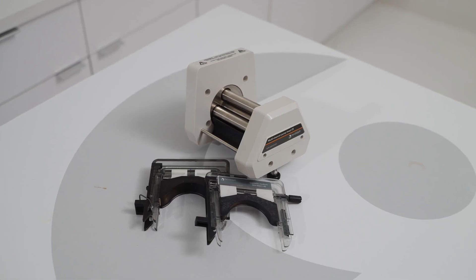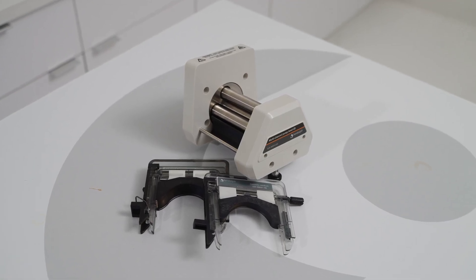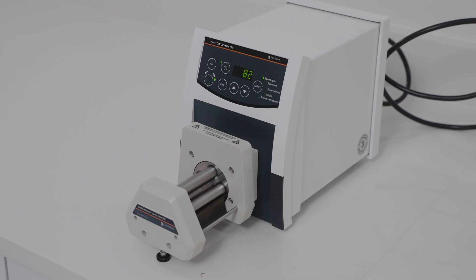The second multi-channel pump head is called the C8. The C8 is able to hold eight medium cassettes or four large cassettes, meaning you can pump up to a maximum of eight different liquids at once through its four roller system.